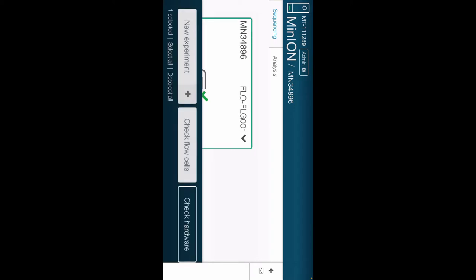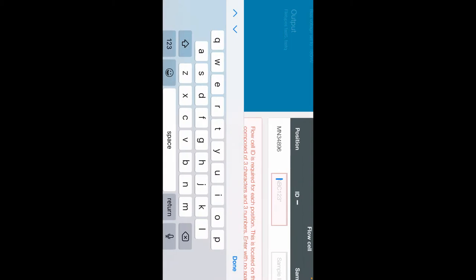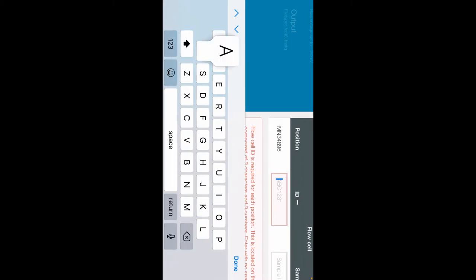And now it's asking for a flow cell ID again. AEQ, and I forgot it, so I'm going to peek: 673.